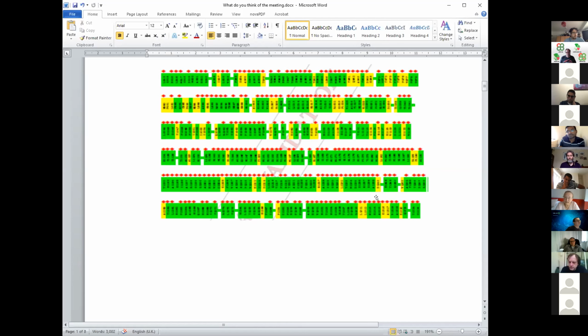Was the problem made by the person who deposits the data, or was it a problem in the evaluation of the data in our EM database? Look, how can it be that he has 20 chains, all of them like that? Who made a mistake? I do believe it's quite a simple trouble. Wrong origin. The origin for the PDB files and the EM map are slightly different. It's a question: can it be fixed within the EM database or not?